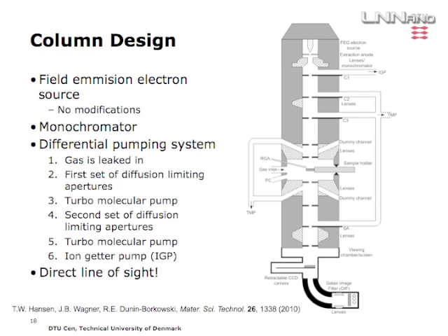We then let the gas get a stable pressure in the sample region. We let the gas leak out through these apertures, and then we pump it out again. We do that twice. That means that we can go from about, say, 10 millibars to 10 to the minus 3 millibars, to 10 to the minus, I think it's 10 to the minus 5. And then at the way top, you basically see no change. So the gun is completely safe in this setup.